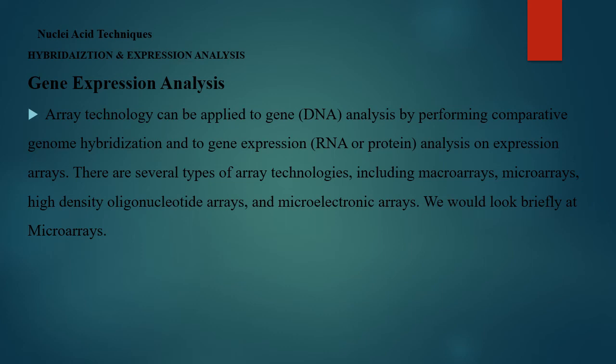Now we come to gene expression analysis. So you want to know what the output of a particular gene is. How do you go about it? Now, array technology can be applied to gene analysis or DNA analysis by performing comparative genome hybridization and then leading to gene expression.